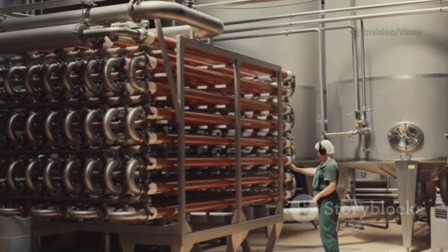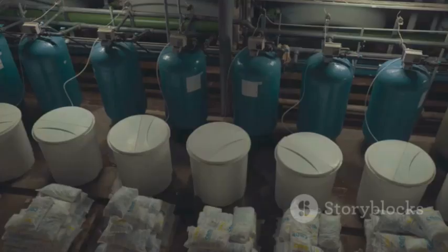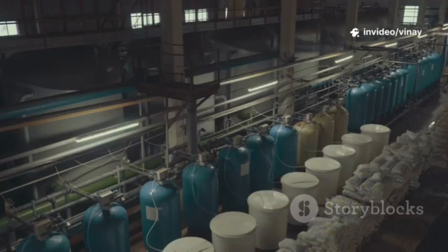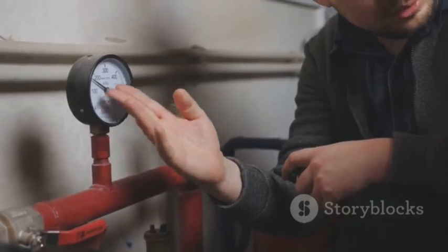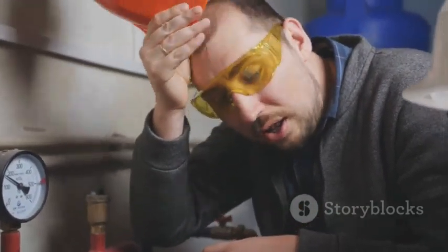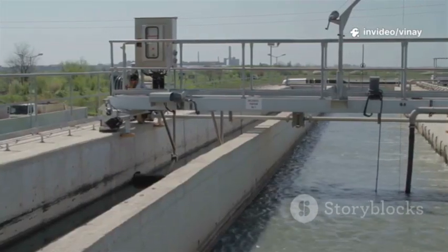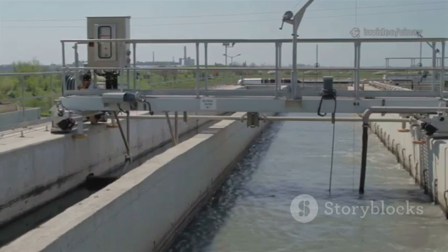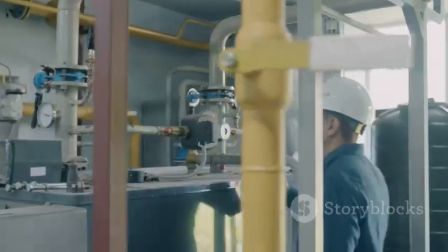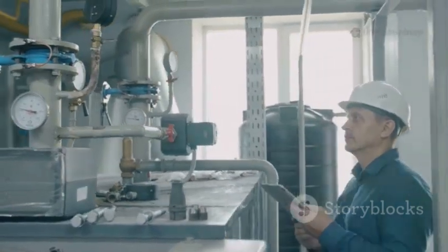On the other hand, the term forward flow test is often applied to larger filtration systems, like those used in full-scale manufacturing that might involve multiple large filter cartridges. In these big systems, the total surface area of the filter membrane is huge. Even with a perfectly integral filter, the total amount of gas diffusing through is significant. The name forward flow is a more general term that encompasses this total flow of gas moving forward through the system. It's still measuring diffusion, but it acknowledges that on a large scale, we are measuring the total forward movement of gas, which is primarily diffusive.